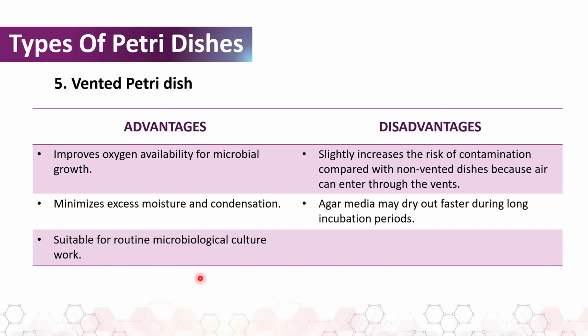Advantages and disadvantages of the vented Petri dish. So let's start by looking at the advantages. 1, it improves oxygen availability for microbial growth, it also minimizes excess moisture and condensation, and it is suitable for routine microbiological culture work.